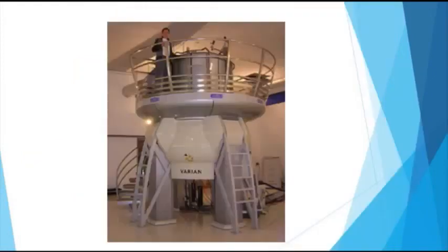It's magic. So this was the machine. For those who've got the actual monitors, this was the machine which introduced me to NMR. At the time, it was the most powerful one in the UK, and it was pretty cool. The health and safety briefing for this machine was simply epic. So I was told I had to take all the metal off because it contains a giant magnet, and I went through like wanding with a metal detector to check I had nothing on me.